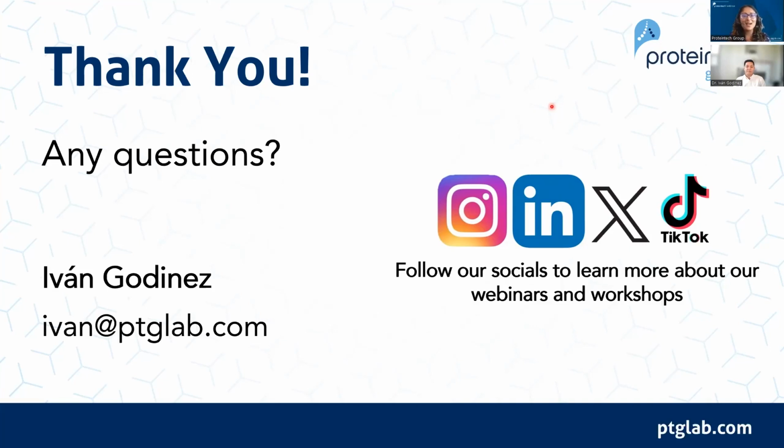Great, thanks, Iván. We have time for a few more questions. The next question is, is it possible to use multiplexed barcodes with fixed RNA profiling together? Yeah, I think I understand your question. The way the kits work is you can have up to 16 sets of whole transcriptome probe barcodes, and that means you have 16 samples you can multiplex together. You can pool them together, and that inline barcoding that I mentioned will enable you to demultiplex individual samples after they've been pooled together.